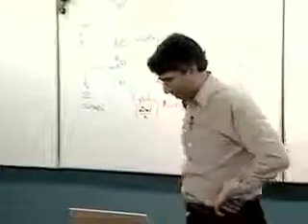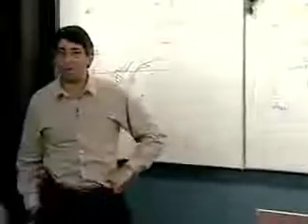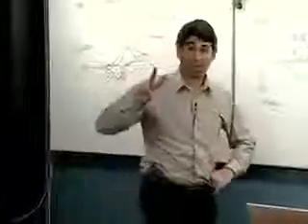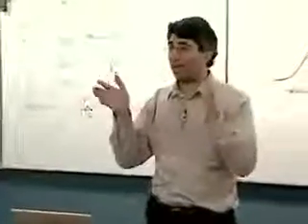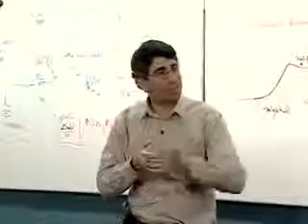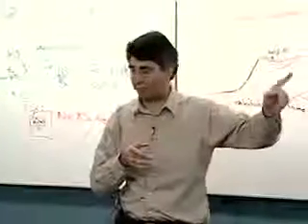Okay, so as I mentioned, if you come in my office with a single scan rate, then you've only sliced the pie one way, and that's not good enough. And if you come in my office without a separate cyclic voltammogram, at a single scan rate, that does not have the redox active species in it, that's problematic also, okay? Because the baseline of the second peak is not the only issue.